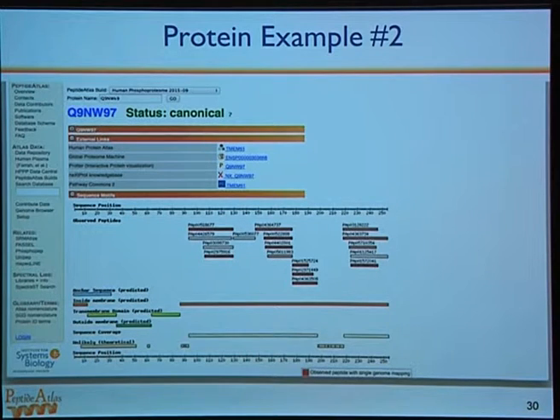We don't only have tryptic peptides in the PeptideAtlas. We have a number of other enzymes, and it actually adds a lot of diversity. But in this case, this is the unlikely theoretical, based on tryptic peptides. And you can see that this gap here is also explained because there are a bunch of tryptic sites through there. So in a lot of cases, you have a much more restricted set of peptides, and you can explain it based on other biological information.